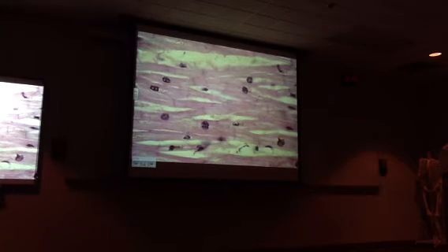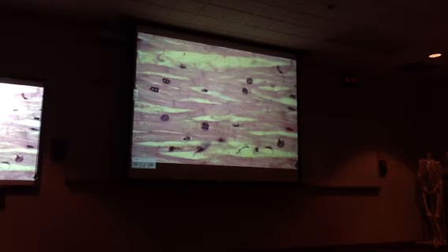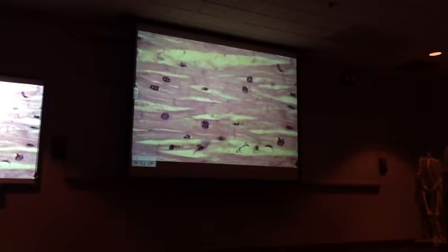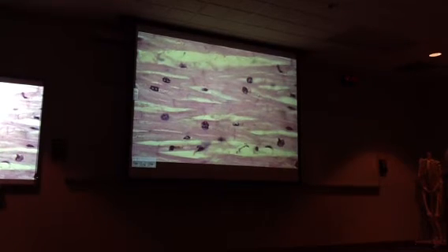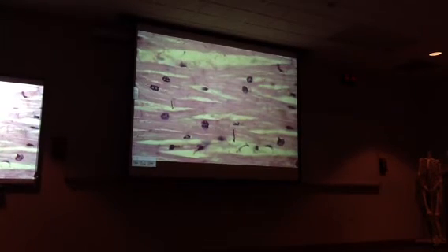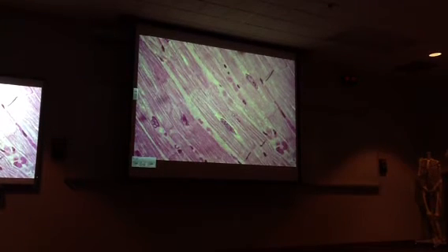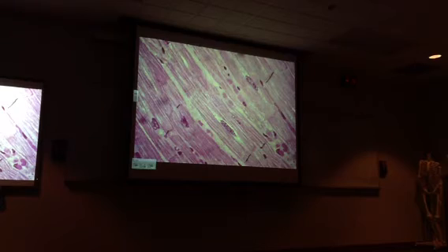Okay, you look at this impression that the fibers are branched. Very, very characteristic of cardiac muscle, with the branched fibers. Okay, nuclei are in the center, and I think you can sense that they have striations. And even at this power, you can sometimes see profiles of the intercalated discs, which you can see there too. These are the intercalated discs. Make sense?